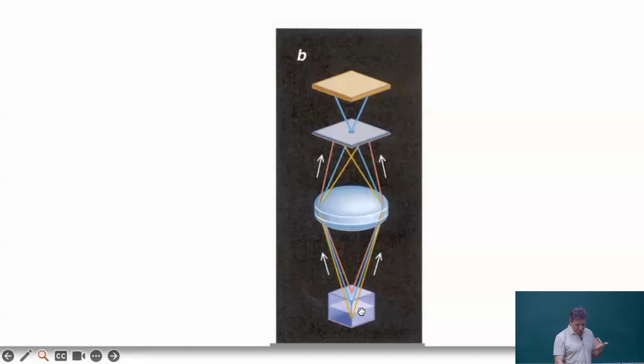Because the system is focused there, what is at this focal point will go through the lens, through the pinhole, to the detector. Anything closer to the sample, above your point, will go through the lens, but it will stop at the pinhole and doesn't get to the detector. And what is beyond the focal point will also crash and will not go through the pinhole into the detector.